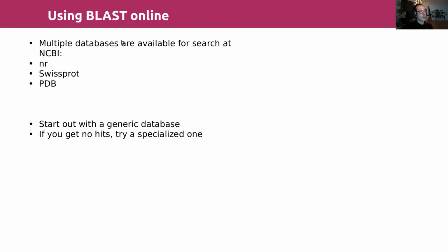And multiple databases are available online for using BLAST at NCBI. So there's nucleotide BLAST, protein BLAST, and a good procedure to follow is to start out with a generic database. And if you happen to get no hits, then you would maybe refine your search and choose another database, a specialized one.